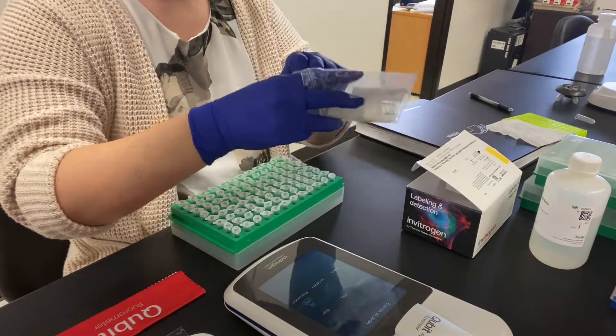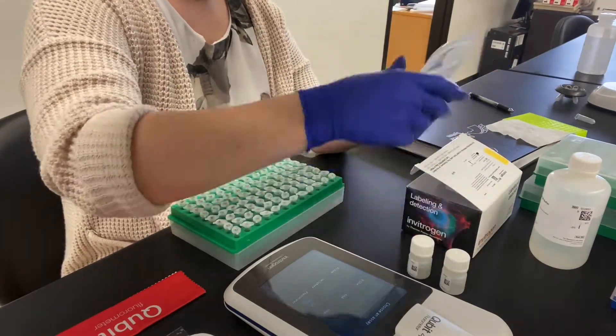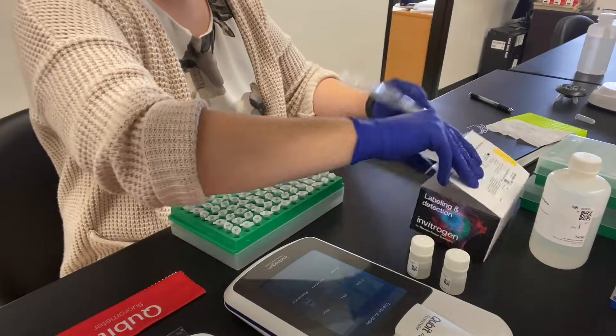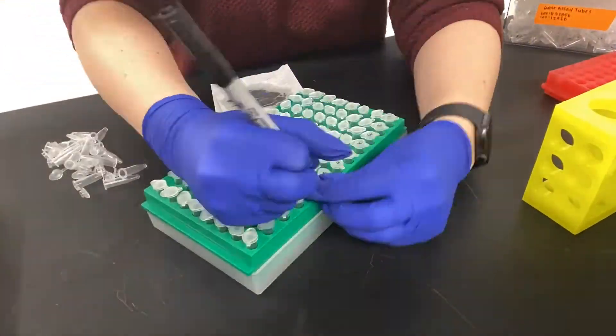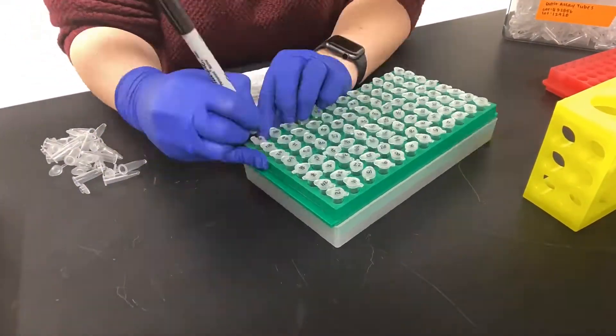Before starting your assay you'll definitely want to equilibrate your standards to room temperature — they are kept in the fridge and this takes about 30 minutes. During those 30 minutes I like to take that time to set up my tubes and label them, which is something I had already done prior to this video.